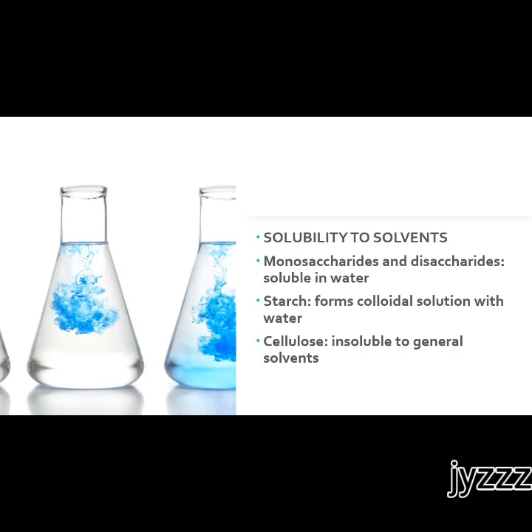Let's take a look at the solubility of your carbohydrates. The solubility of your carbohydrates is inversely proportional to the complexity of the structure. If you have increasing carbon atoms present in the chain of your carbohydrate, then the solubility in water is decreased.